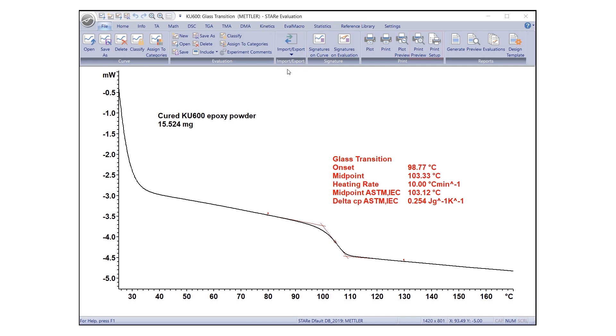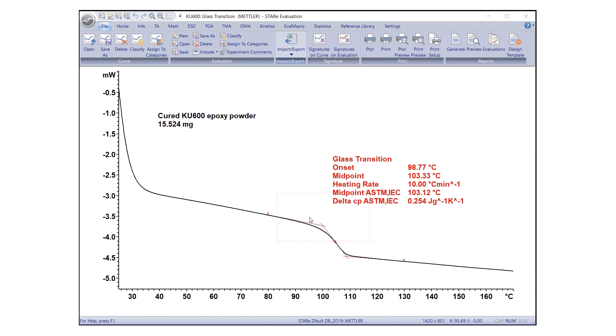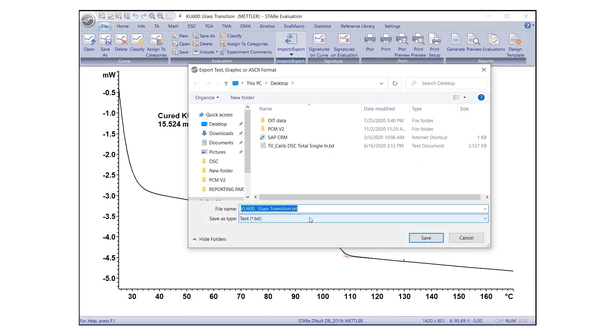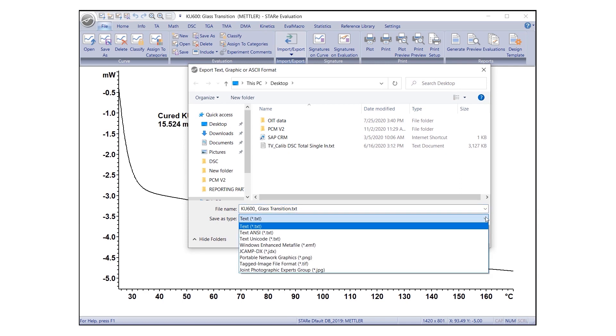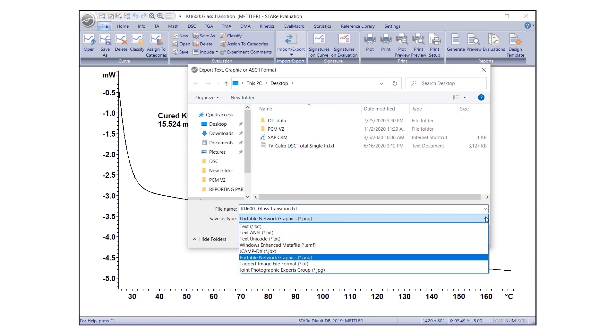To start exporting the curve or evaluation, under File tab, go to the Import-Export group and click on Export Other Formats. The dialog box Export Text, Graphic or ASCII format will appear. Select the folder to which you wish to export the file. The file name for export will be automatically suggested or type in the desired name.